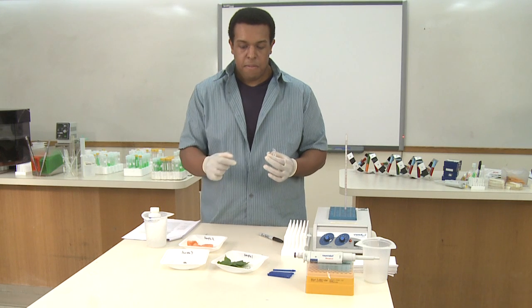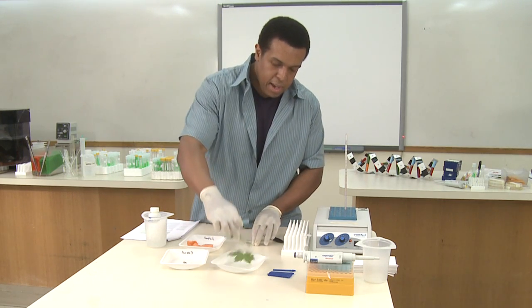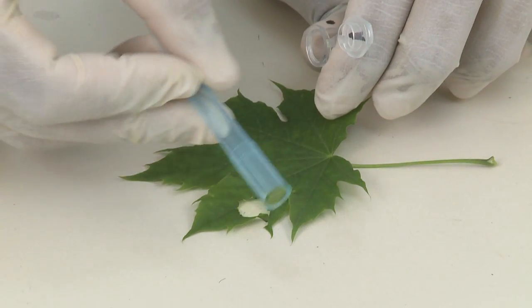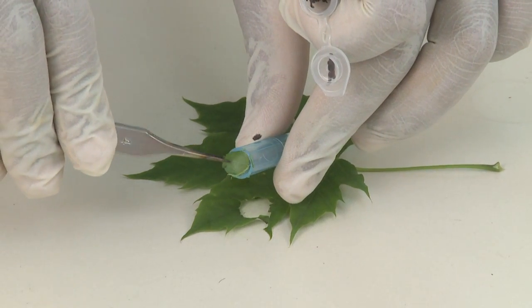For a leaf, what we can use is a blue pipette tip — this is a P1000 tip. You can actually use it to make a cutout of the leaf. What you're going for is a very, very small section, and when you use the tip you get a nice round cutout.